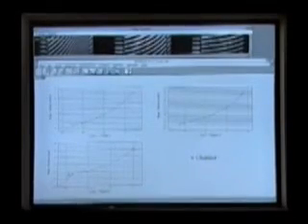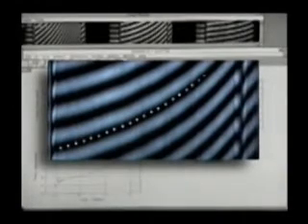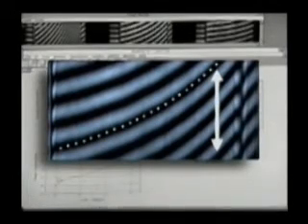Concentration readings collected by the optical system are delivered to the computer as a pattern of black and white stripes, referred to as fringes. Here we see patterns for each of the three sample concentrations we loaded. The upward shift along the fringes indicates increasing protein concentration. The greater the shift, the higher the concentration.